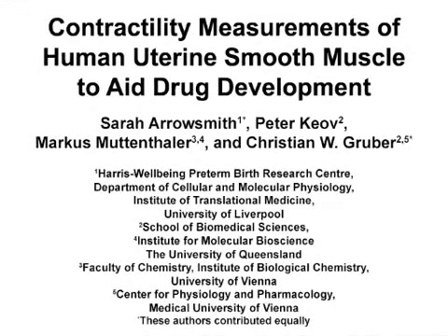The overall goal of this procedure is to determine the effects of various agonists, antagonists, or novel agents on ex vivo human myometrial contractions, to investigate myometrial physiology and to validate pharmacological data from novel research probes or drug leads.